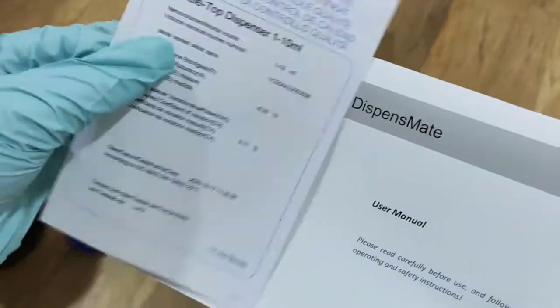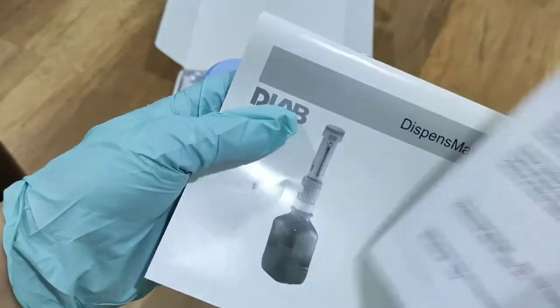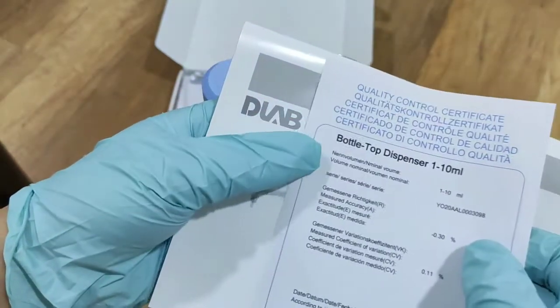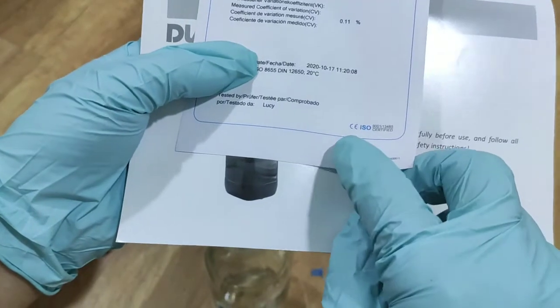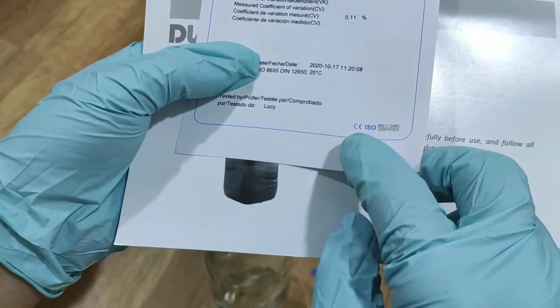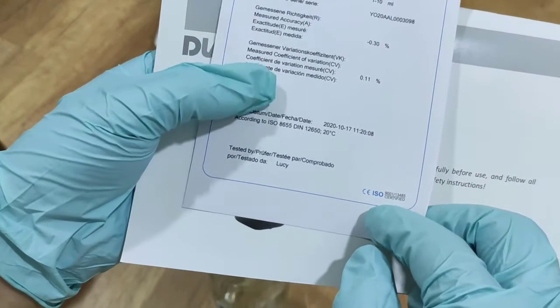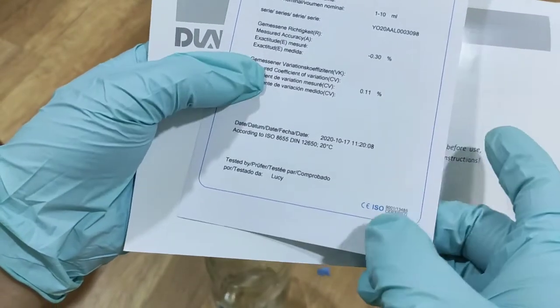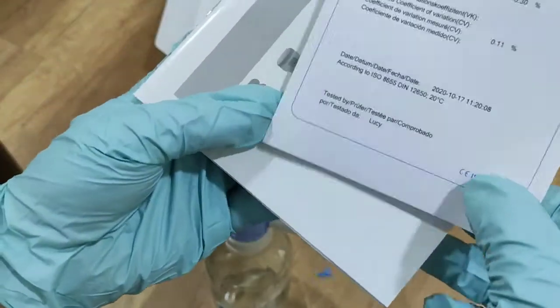For each of the dispensers, it has the certificate. It is quality control certificate, or you can call it calibration certificate. It is according to the ISO. There's the ISO certification and also the CE certification. Alright. That's it. Thank you so much.